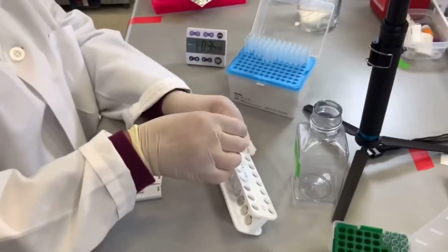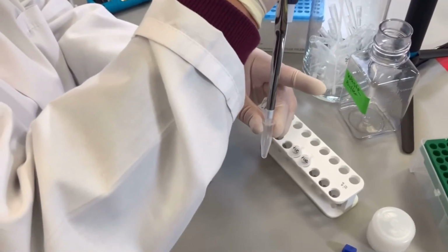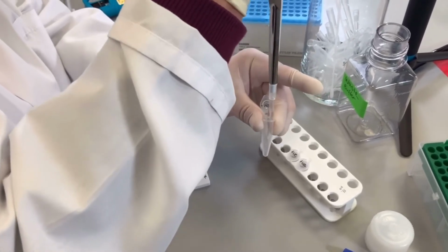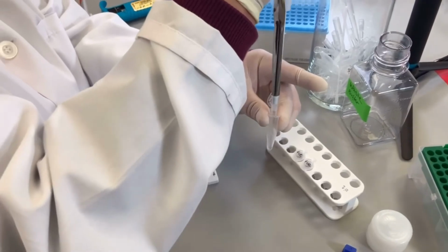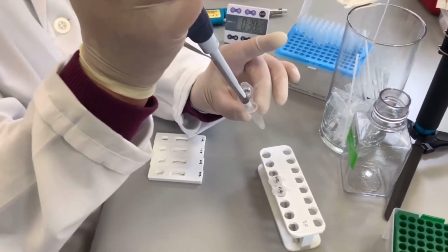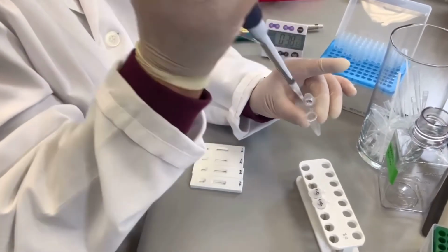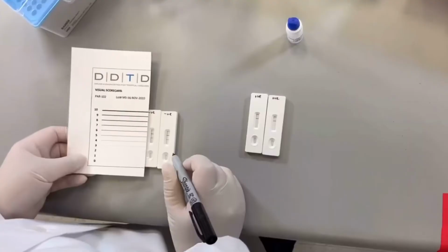Add 2 drops of chase buffer into the vial and remove the vial from the magnetic rack. Wash the particles from the side wall of the vial and mix by pipetting several times. Again, be gentle so you do not create foam. Transfer the vial contents to the sample port of the cassette. Start a timer or record the start time.